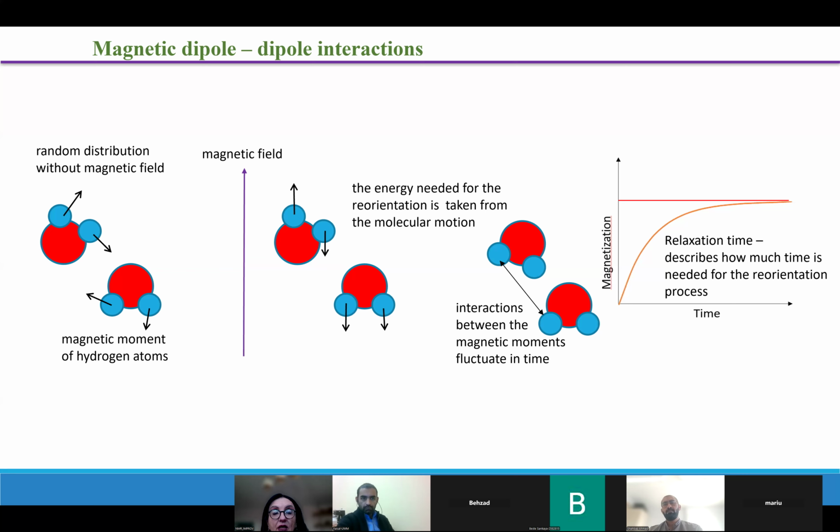It's like, I give a string to two people, keep the string in your hands, and now move around completely stochastically, yeah? The orientation of the line with respect to whatever, I have to choose a reference system, as well as the length, which somehow represents the distance between those two persons, will be constantly changing in time.